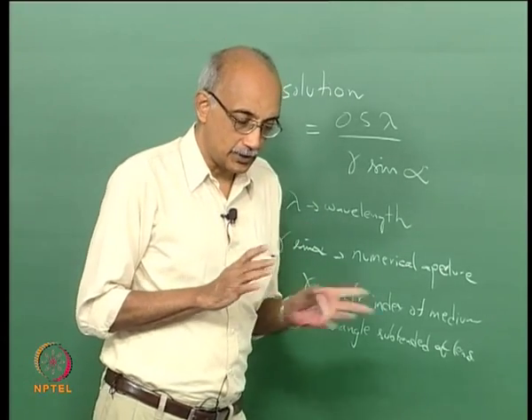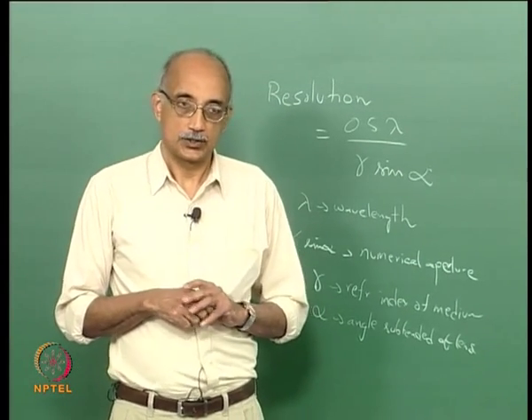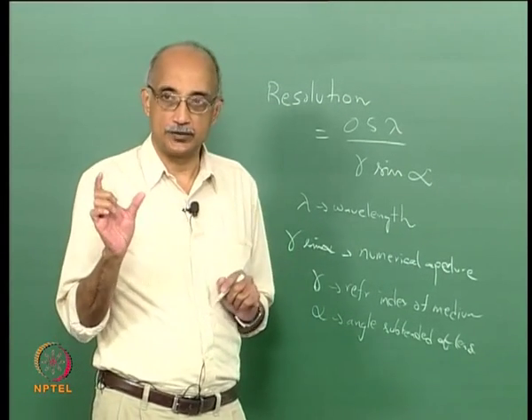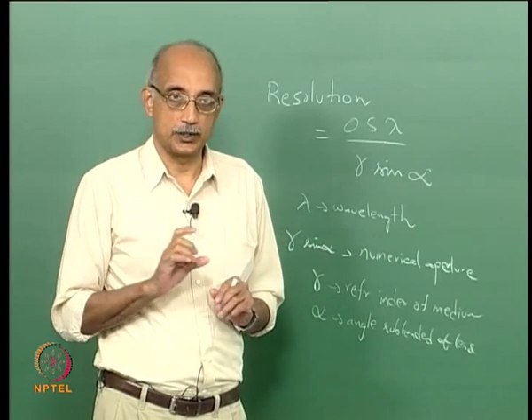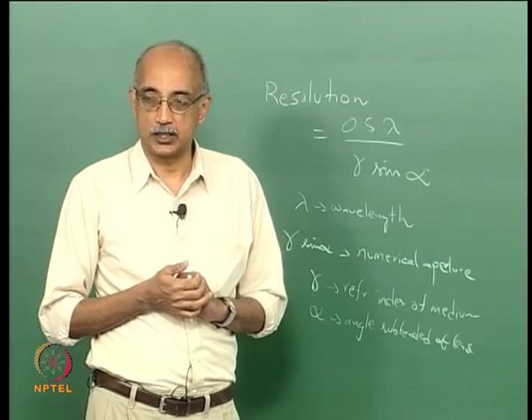So, the parameter that you do have some control over is the wavelength. So, now you are talking about the visible range.